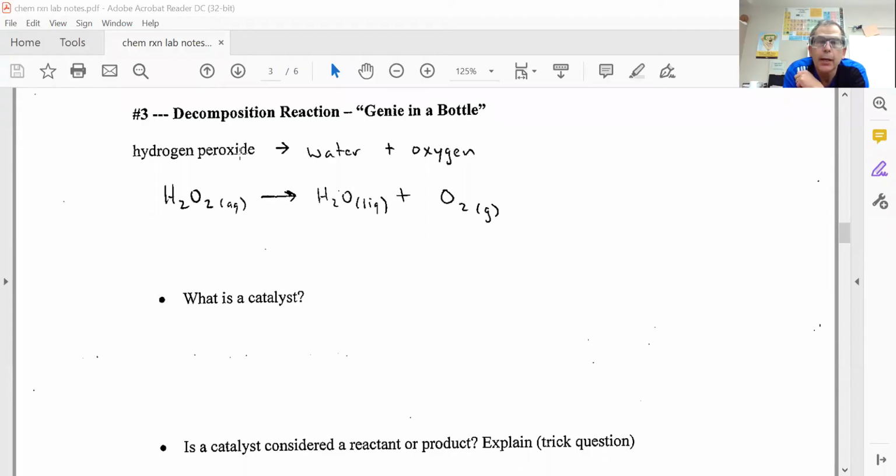In this video, we'll look at chemical reaction lab and look at experiments 3 and 4, which are really two different twists for the same experimental reaction. I'm going to go to a screen share here. In both reactions, we're going to take hydrogen peroxide and break it down into water and oxygen. The thinking is it would probably break down into hydrogen and oxygen because that's what hydrogen peroxide is composed of. But if we did a burning splint test, it would not pop.